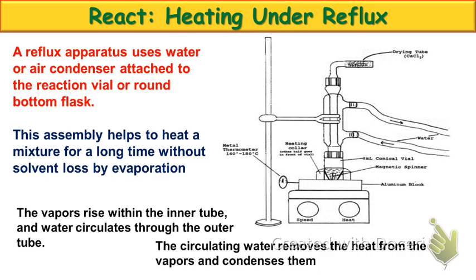Okay? As far as the reaction conditions, we'll add heat to our reaction, but we mentioned a problem with this. Your product has a lower boiling point, which would mean if we just heat this reaction up, what happens to your product? Boils away, turns into a gas, disappears. We don't have product anymore. Okay, so what we're going to do to maintain heat in our reaction but not lose any of our compounds, either our products or starting materials, is we're going to do something called reflux.